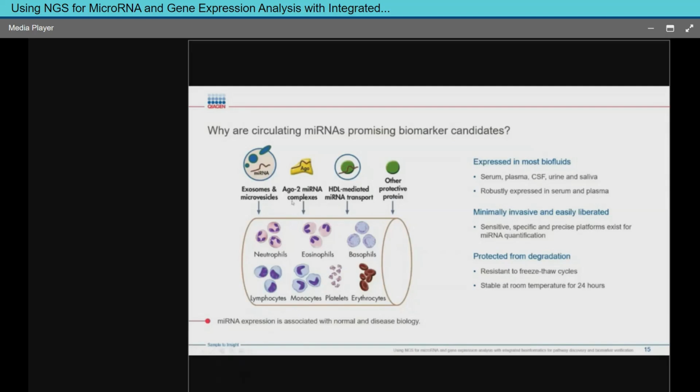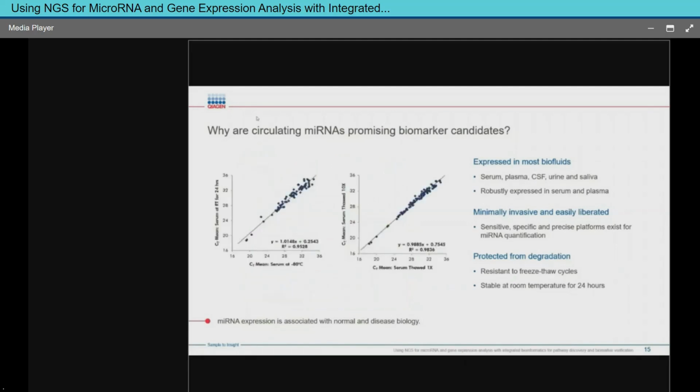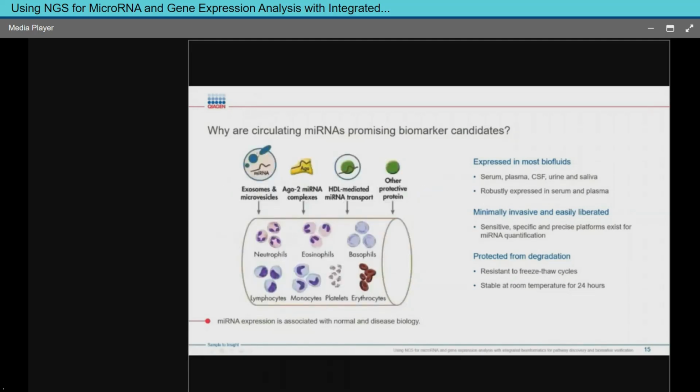One of the ideas around working with exosomes is that exosomes are able to preserve the cellular components of where they're coming from. In addition, exosomes can be specifically enriched and then classified based on the protein markers of the exosomes. So there are researchers that are enriching for the exosomes and then extracting the RNA out of that, classifying based on the different protein markers, and using that as the definition of the sample that they're starting with.